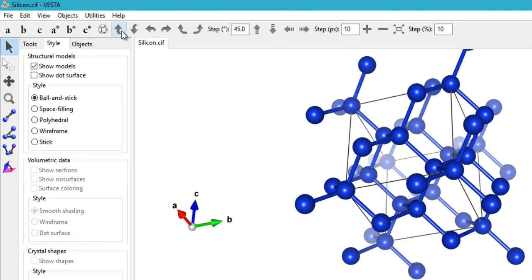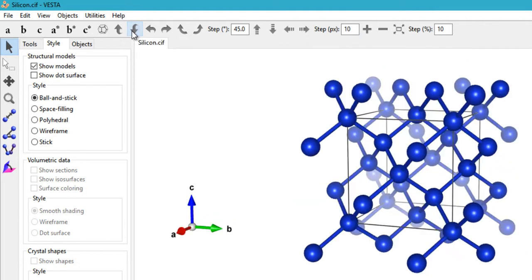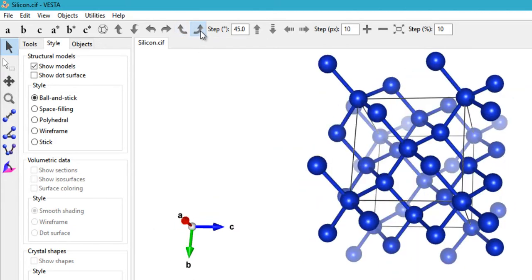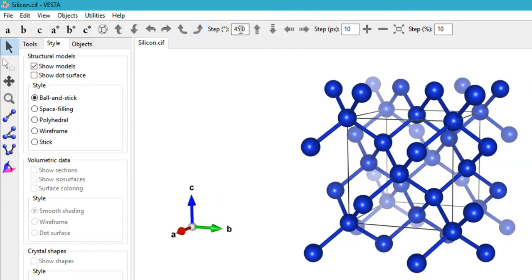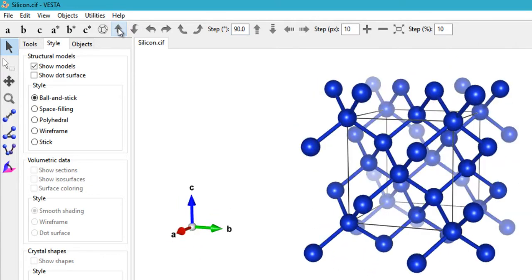You can rotate the crystal along the X-axis by clicking here, and rotate it back in the opposite direction to return to the initial position. Similarly you can rotate along the Z-axis and rotate back. You can set the step width — for example, setting it to 45 degrees means one click rotates by 45 degrees, so after eight clicks you complete a full 360.